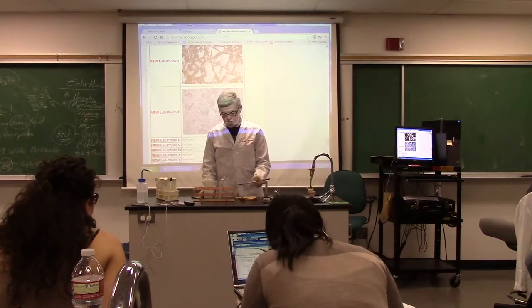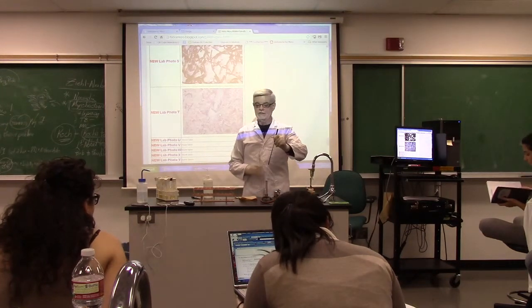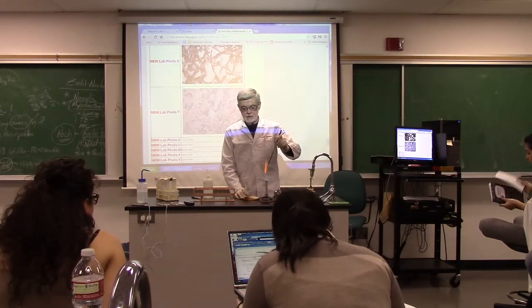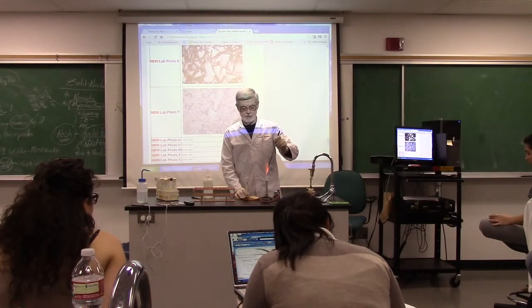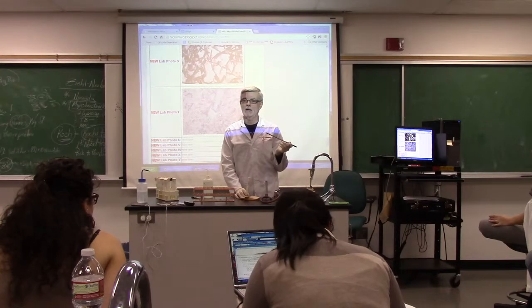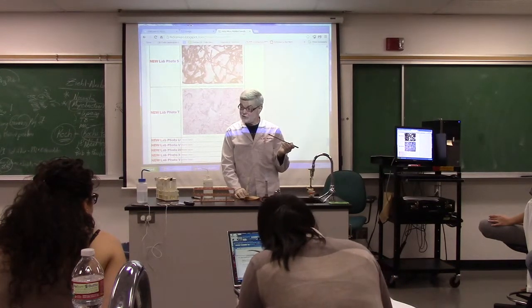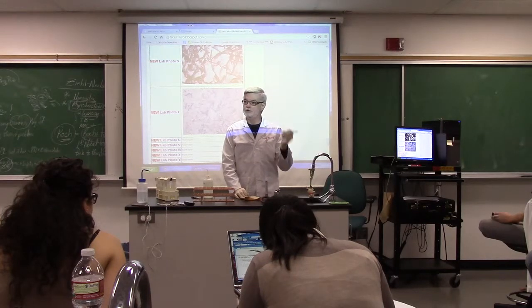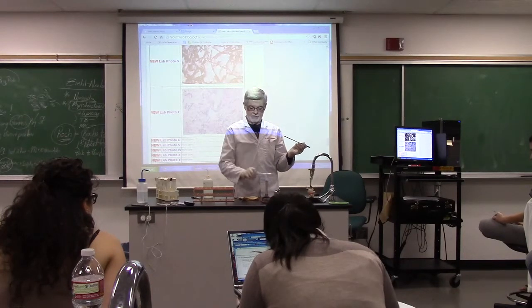So I'm putting my drop of water on there. I'm heating this to red hot. Someone said in the other class, if you just heated it and you're using water that doesn't really have any bacteria in it, why do you have to heat it again? Good technique. You really don't have to. It's just always, you start with a sterile loop and you end with a sterile loop. Just good technique.